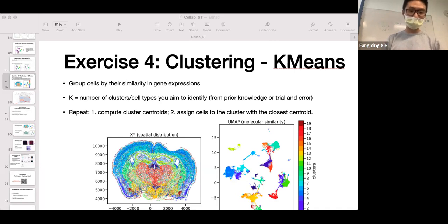So how do we do z-score? Now we have the centroid. Centroid is here. We first subtract its mean for each gene. So actually, how do we calculate the mean for each gene? That centroid's mean axis equals 0 or equals 1. We could check, equals 0. So for each gene, we get its mean expression, and we subtract by its mean. So every gene has the same mean, which is 0, and divide by the standard deviation for each gene. Let's see if this works. Okay, it actually works. So the results, let me call it z-scored centroids, if you will.